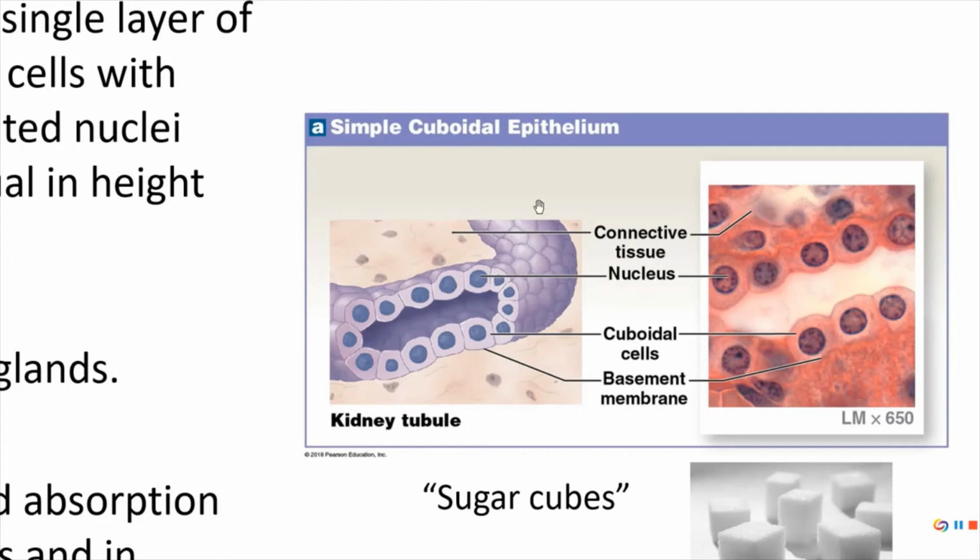And then all this stuff here is connective tissue. So these are nuclei of connective tissue cells found on the outside. But see this line right here. This line is the basement membrane. And this is your free space, the tube opening where the urine to be that the kidney is making would actually be collected. It's where the fluids that are going to become urine end up being inside. And these tubes are used to make urine. That's what their job is.